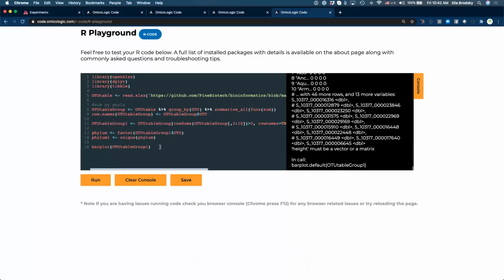So here, what we need to do is make sure that before we run this, we need to convert it to a table. So we're going to use OTU table 1. Oh, hold on a second. No, we need to make sure that we have named all of our, yeah, so we can make a matrix for this, or we can make a table, first of all, for our OTU table, right?